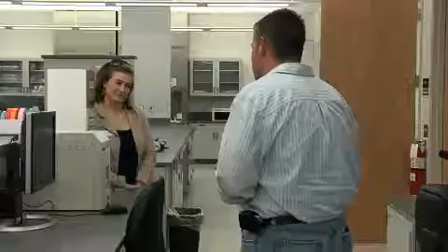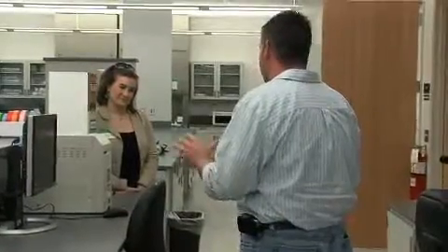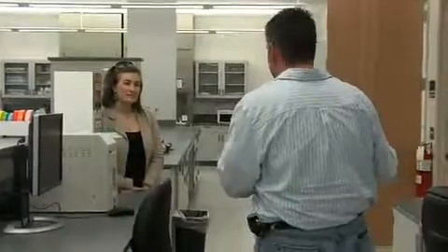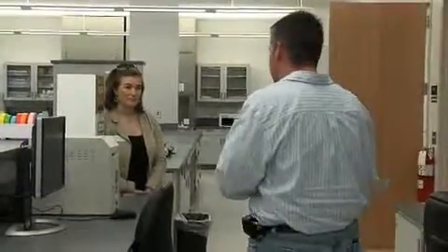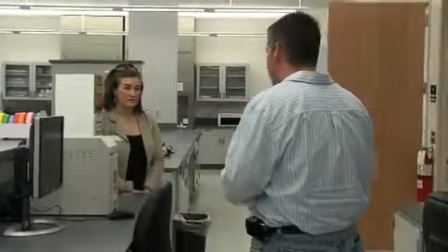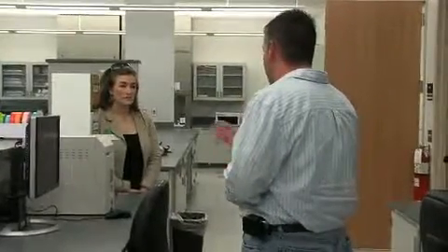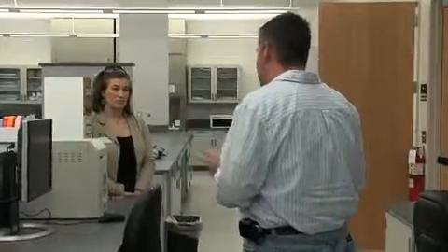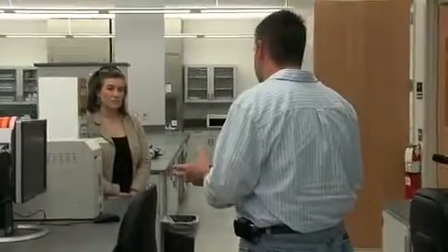So these are the Nikon CoolScopes, and basically the CoolScope is a microscope in a box. What Nikon has done is they've taken all of the objectives and everything from traditional microscopes, put them inside of this box, and they've taken the actual eyepieces off. So what it does is it runs through a computer or uses the built-in firmware and uses a monitor. So what we do is we actually take the slide and put the slide into the CoolScope.